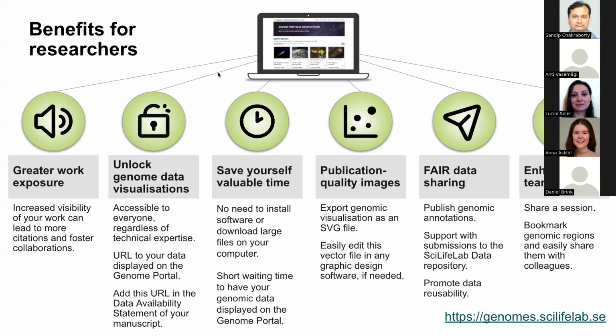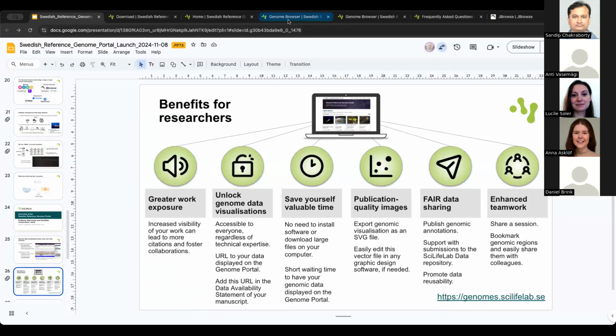So how are we doing with time? Good. Yes, okay. So as we're doing good in time, I'm just going to quickly show you how it looks.